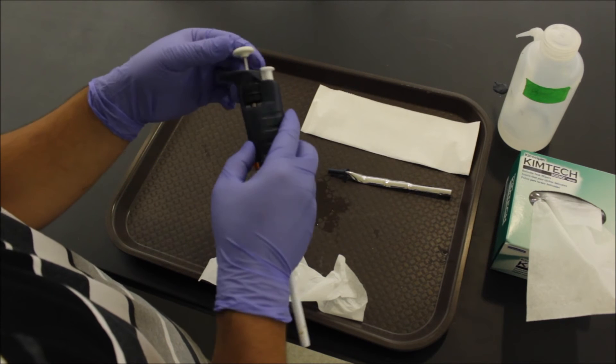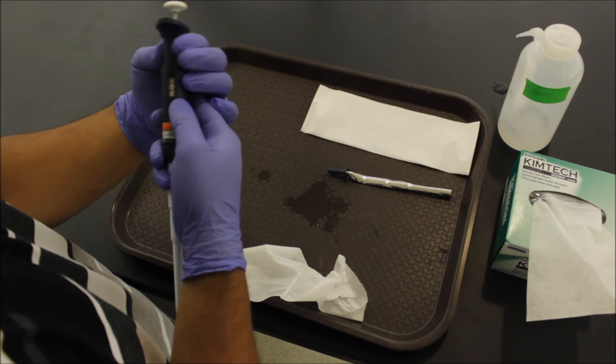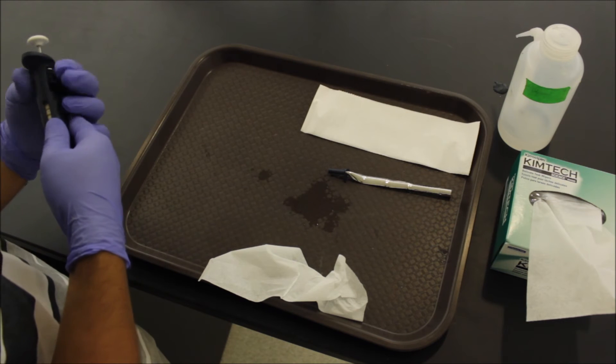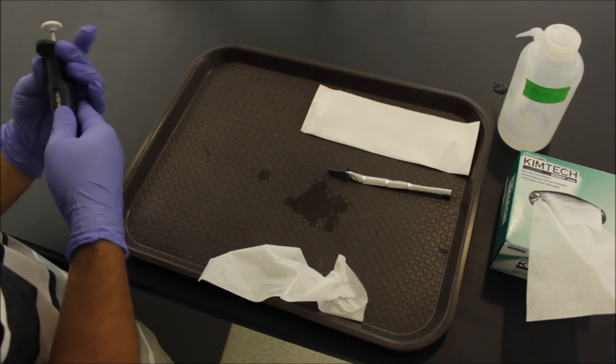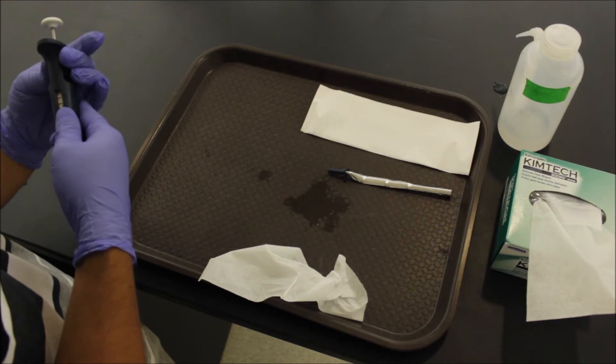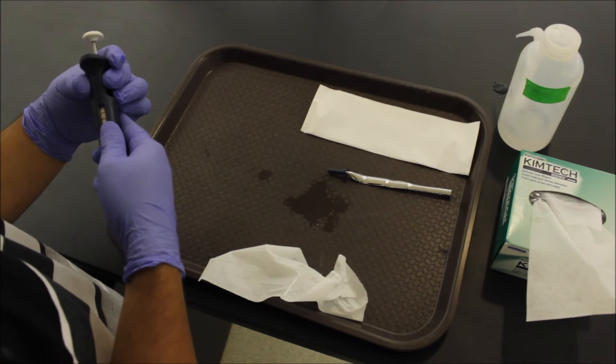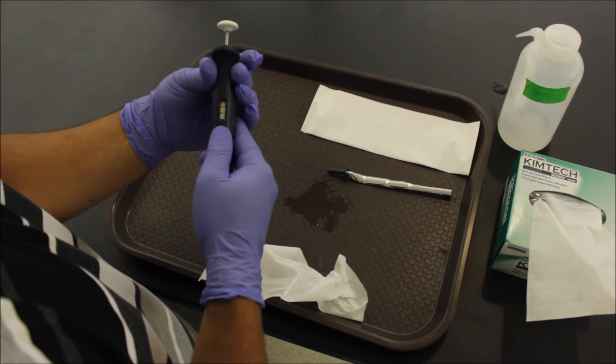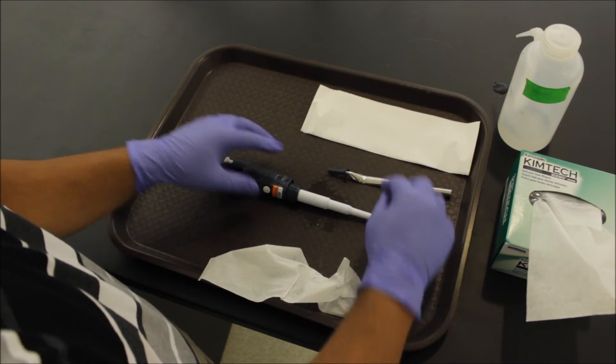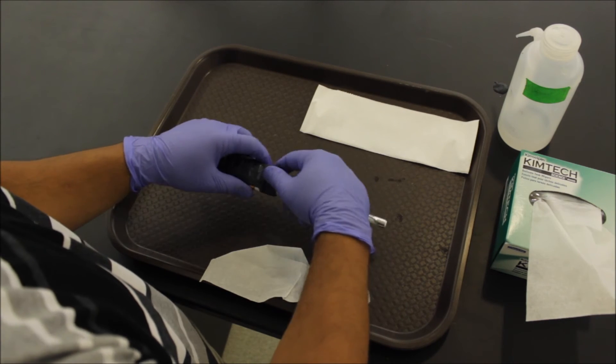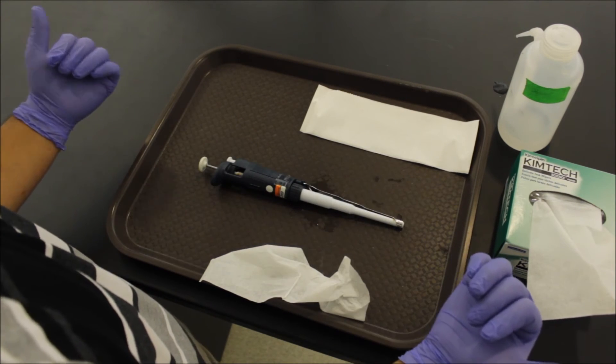All right, we're going to take a second to make sure the dial still works. So we can give that a couple turns. Now we'll set it back to 1,000. Once that's done, we'll just reattach the ejector. Push that back into place. Just like that, you got it done.